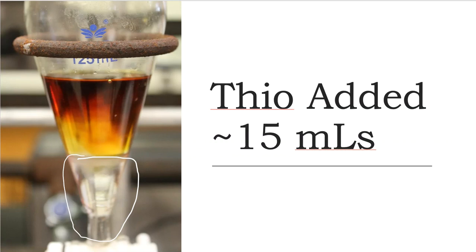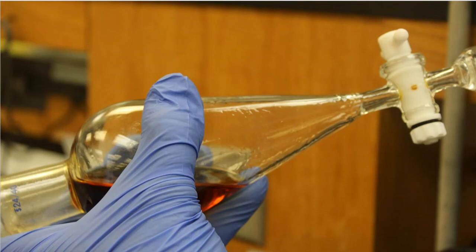Well, I just don't want to pour it in here and not do anything else with it. So what did I decide to do? Well, I decided to pick up the separatory funnel and give it an upside down turn and a rock and a roll and a vent by opening up the stopcock and allowing the pressure to escape. All right, then I closed the stopcock back and I gave it another roll. I gave it another rock, turned it upside down, but I did not shake it like I was making a mixed drink at the house.